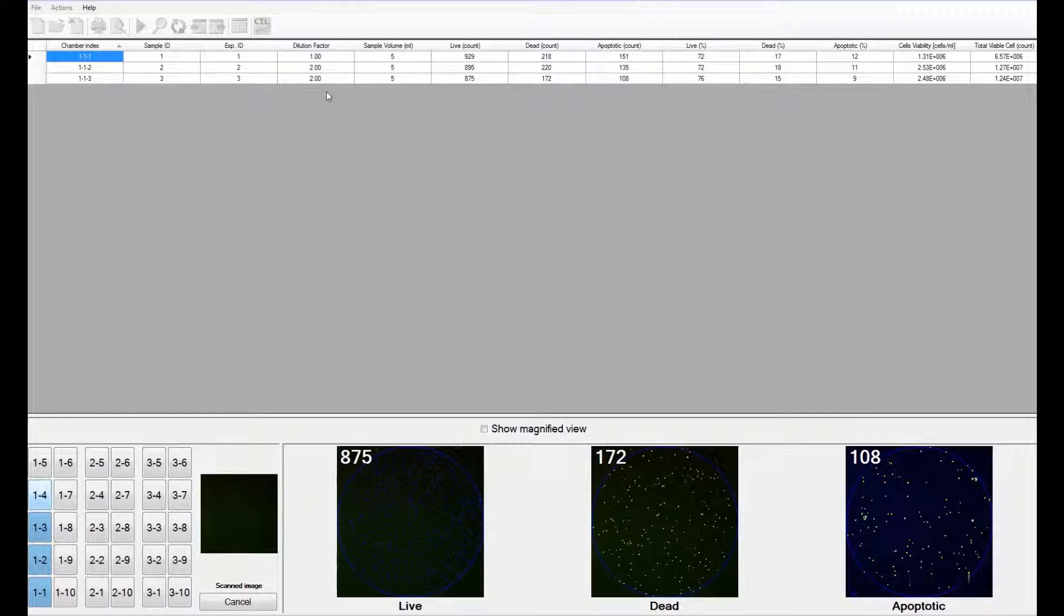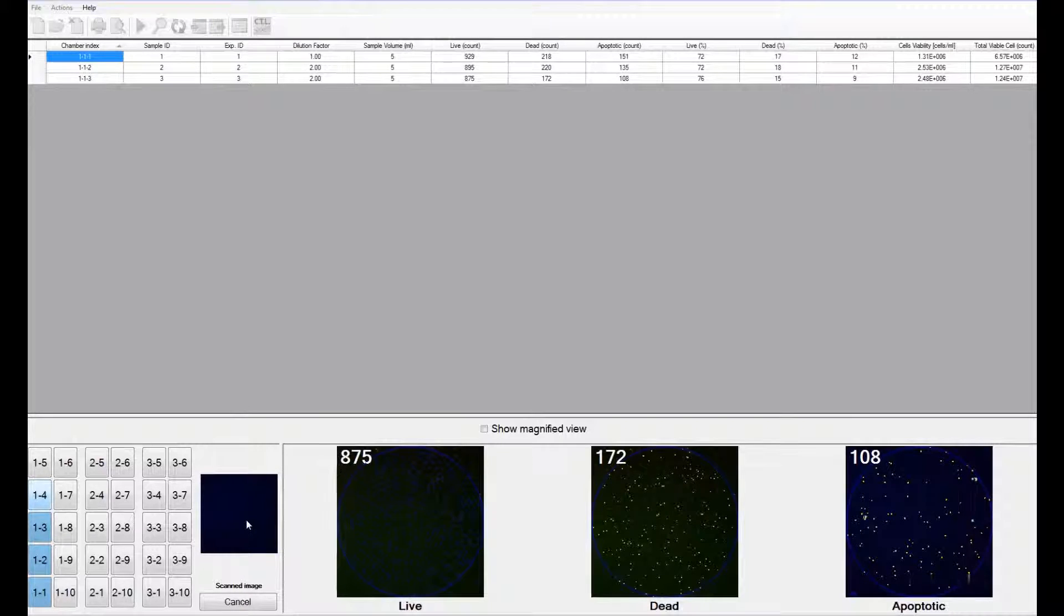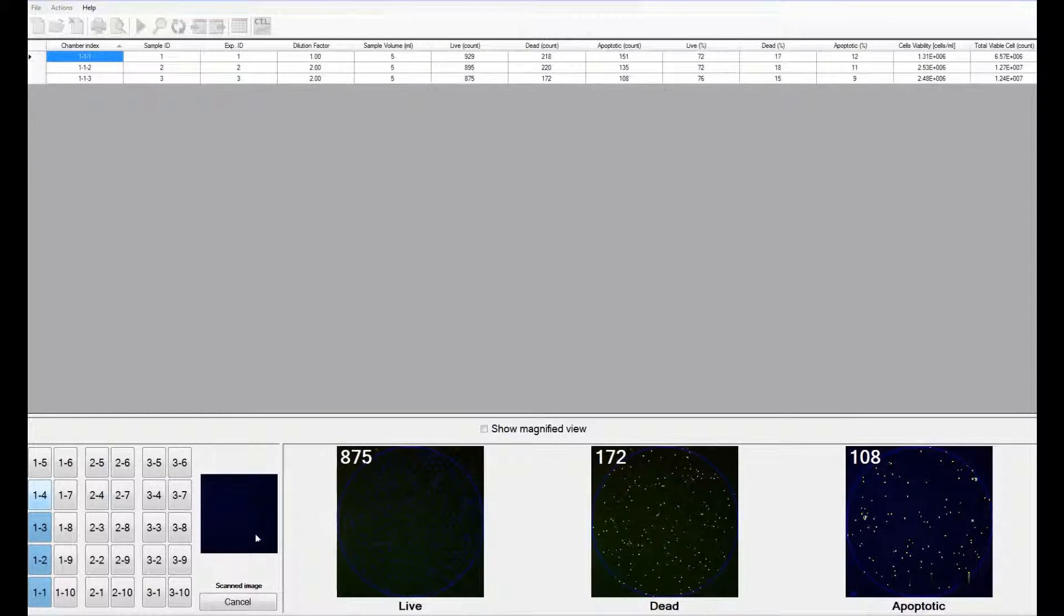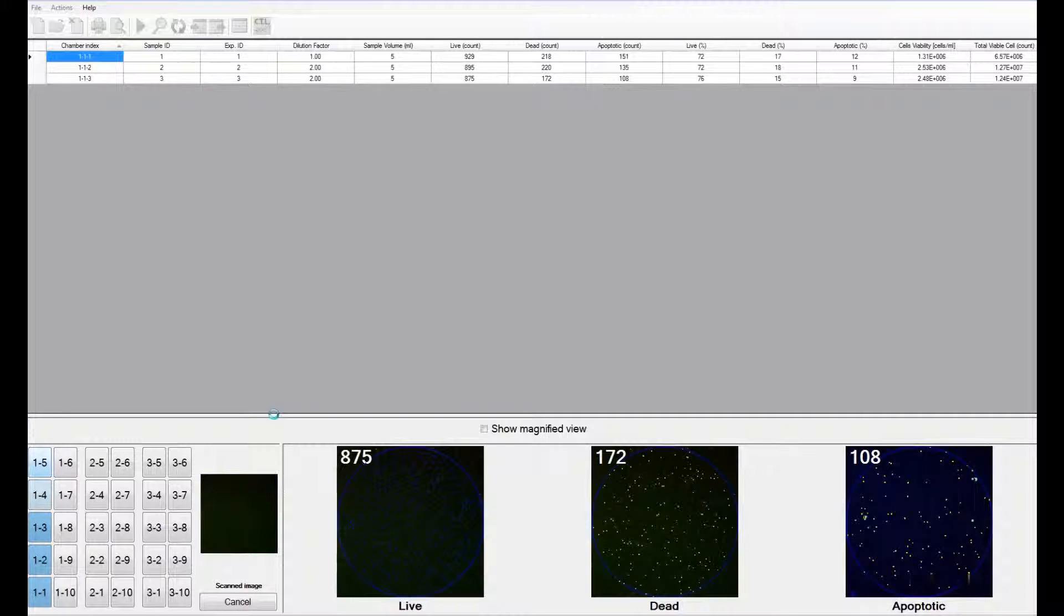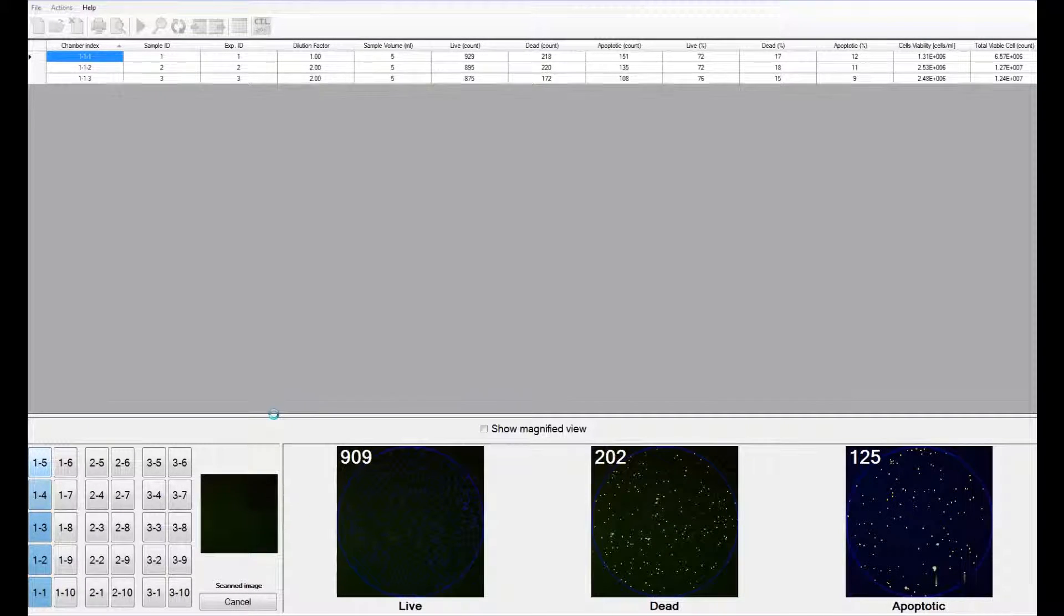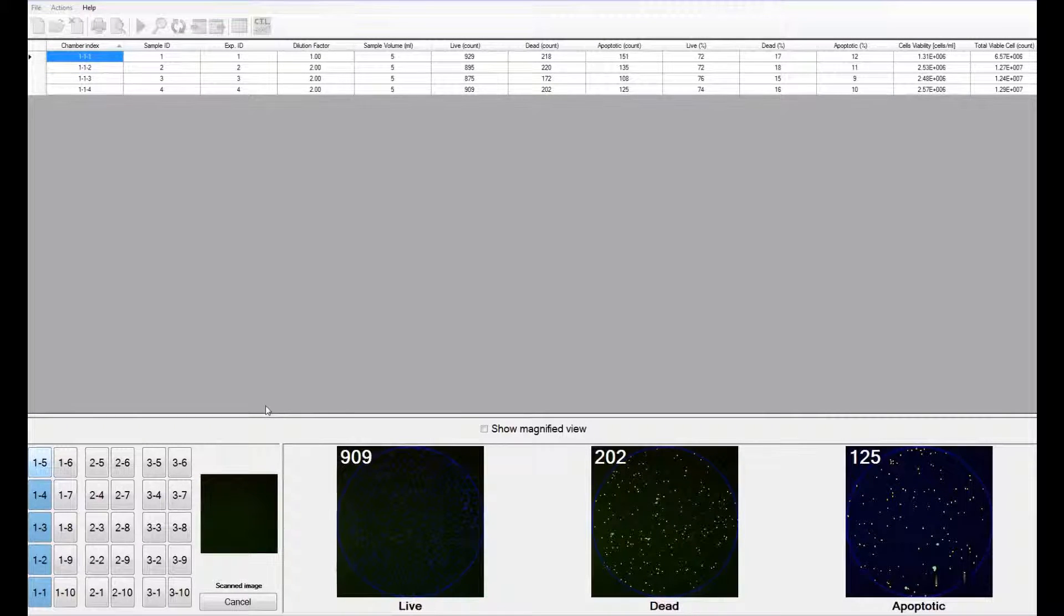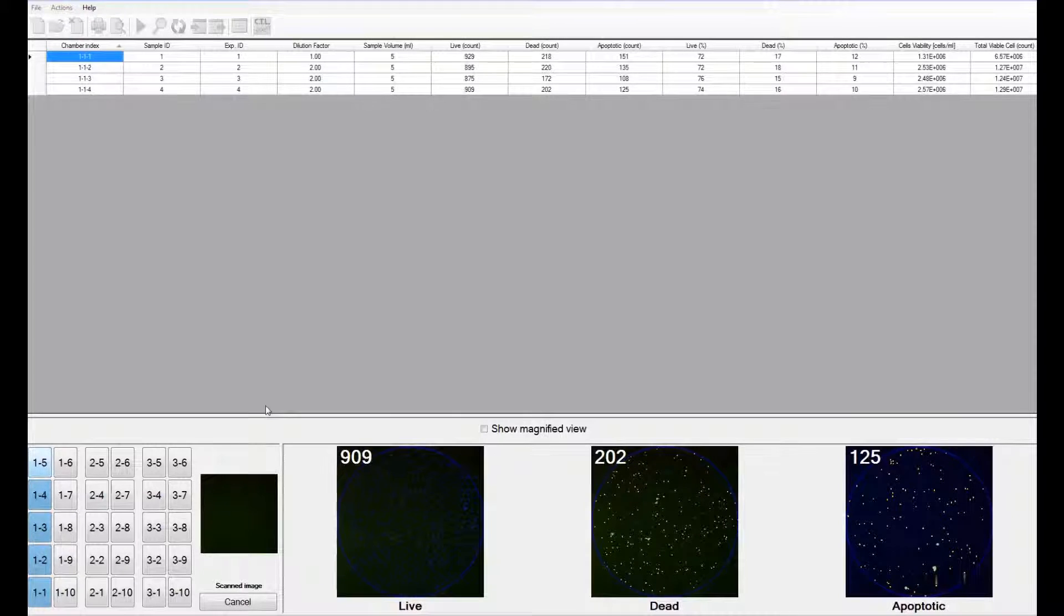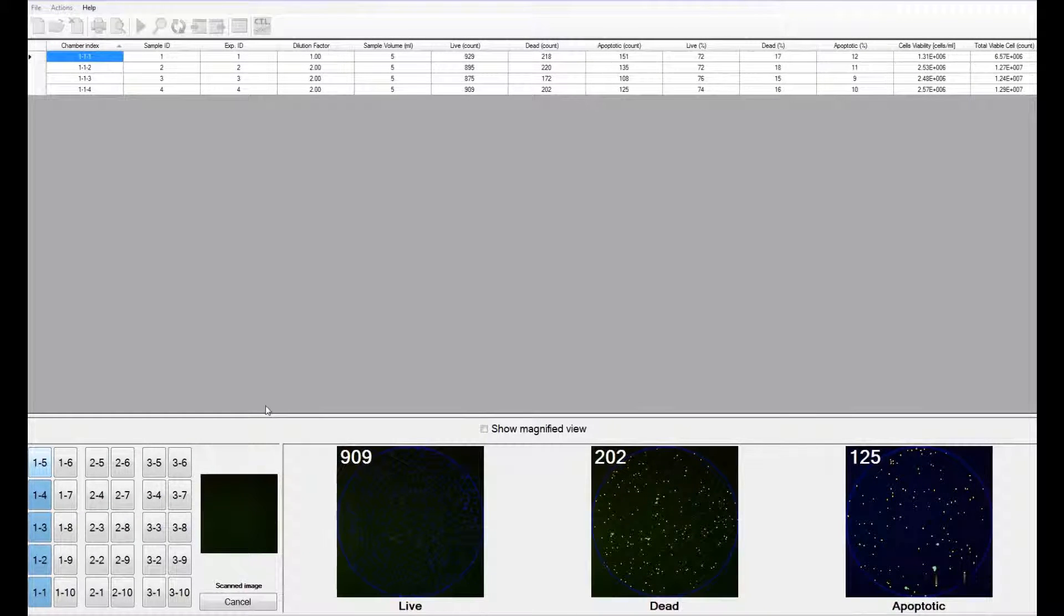The software first scans and counts the live and dead cells in a particular region, and then it computes the apoptotic cells in the same region of interest. It superimposes the live, dead, and apoptotic images to detect cells that are positive for both the live dye and the apoptotic dye, or the apoptotic dye and the dead cell dye.